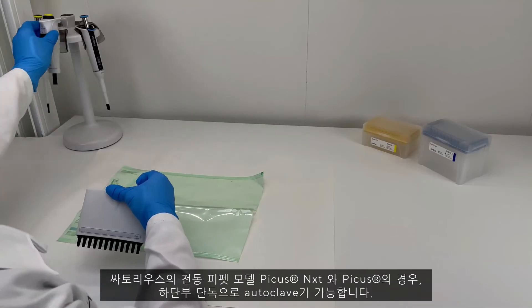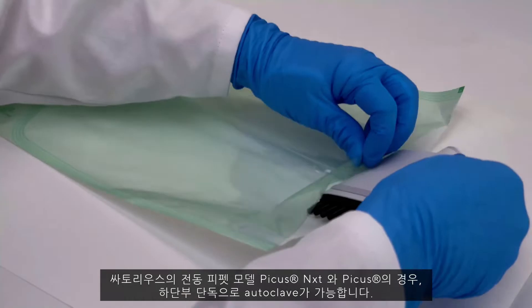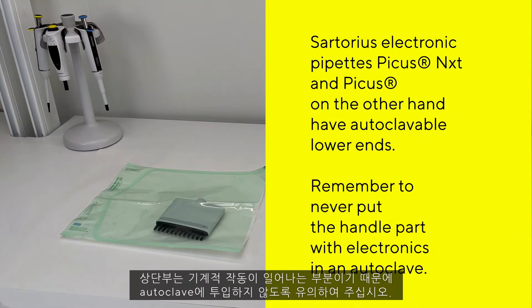Sartorius electronic pipettes Picus-next and Picus, on the other hand, have autoclavable lower ends. Remember to never put the handle part with the electronics in an autoclave.